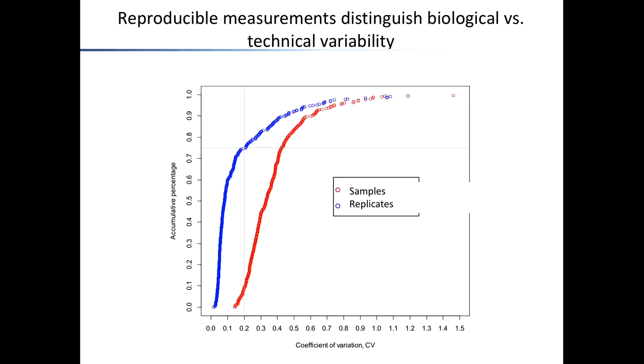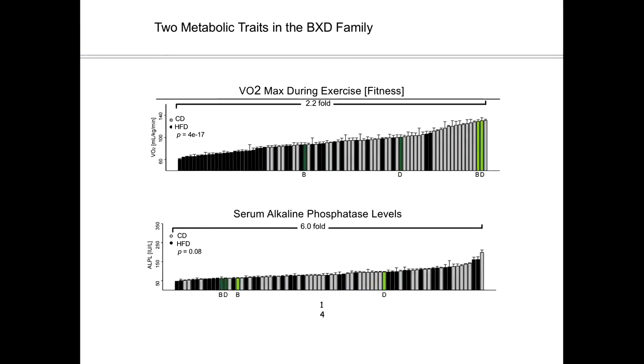and we basically correlate noise with noise. So this is the technique that you learned here, DIA, and also selected reaction monitoring, the kinds of precursor targeting techniques. They have been clearly shown that if they're applied properly, they can be so precise across a cohort that we can distinguish the technical noise from biological noise or biological effect, even if this effect is not very large, like we would expect here.